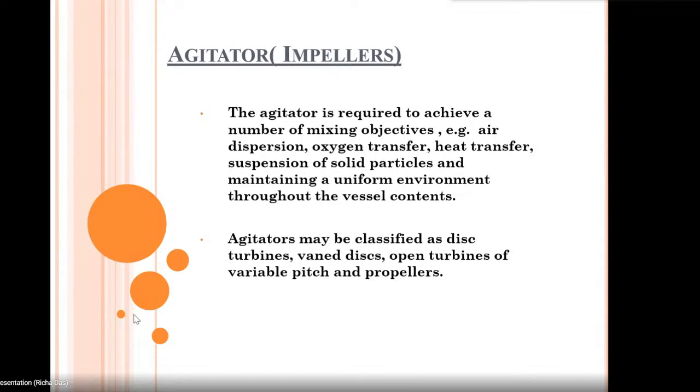The same thing is used in the fermenter as well. Even the fermenters are fitted with these fan-like or blade-like structures, so they are called agitators, or we can say impellers as well. The same function is being done. Whatever production media we enter and inoculate inside the fermenter tank, we want there to be a proper homogenized mixture. So to maintain a proper homogenized mixture, impellers or agitators are fitted inside the fermenter.